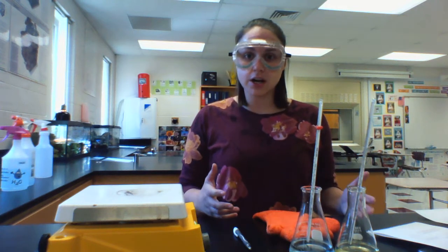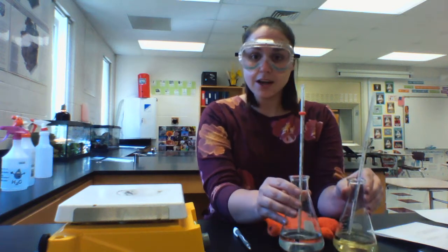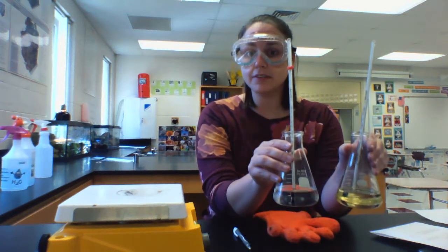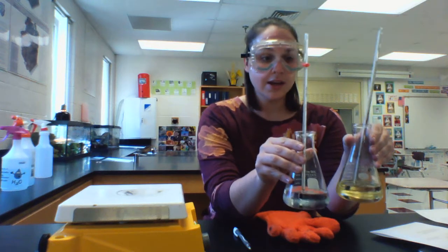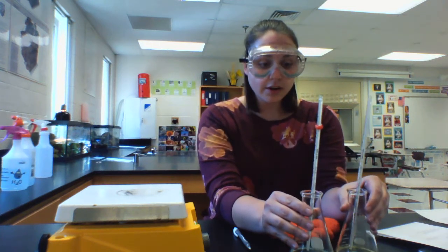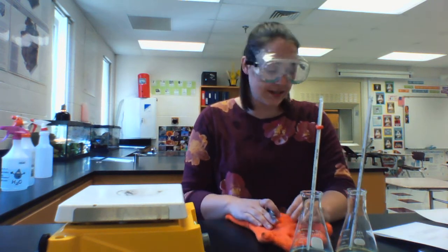What I've done is I've already gone ahead and set up some of the materials. I have two Erlenmeyer flasks here. They both have thermometers in them and they have different liquids. This one has pure water and this one has vegetable oil. Right now, both of these are measuring at 24 degrees Celsius in temperature.